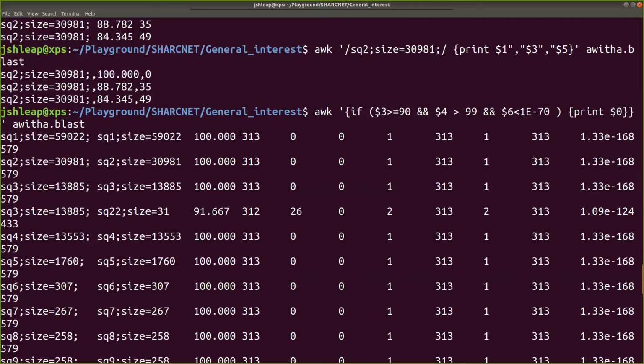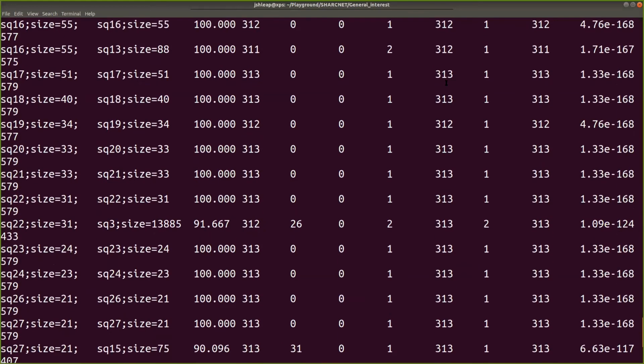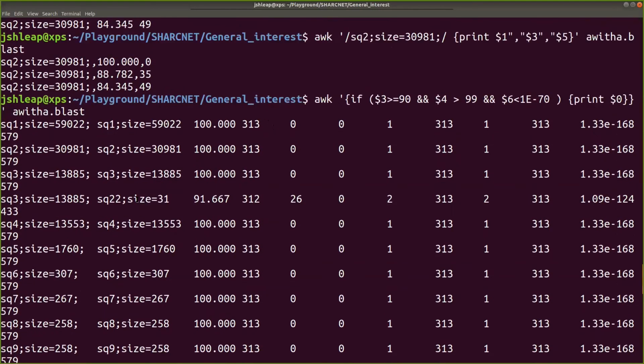Okay, I have a different file here. So let's adjust it to this file. This one is the percent identity, so this one is all right. Then 2, 3. I don't think I have query coverage in this, so I'm going to just filter by e-value. Well, length is not a point because it's all 300. Well, let's say that this one, I don't remember which column this is because this is a different file. So I'm going to say that the 4th one is actually 1, 2, 3, 4.